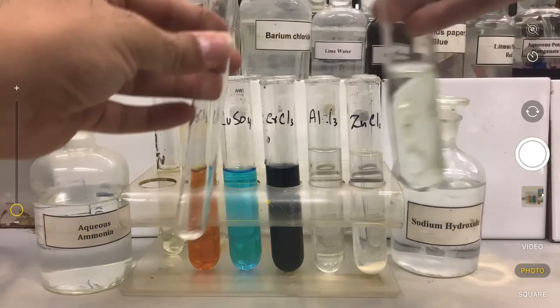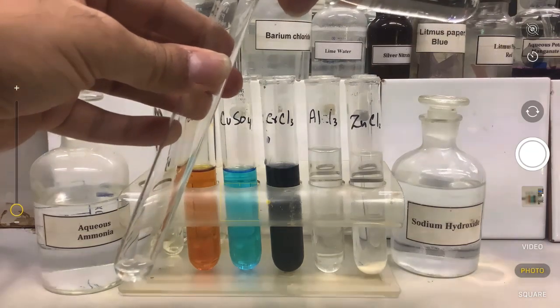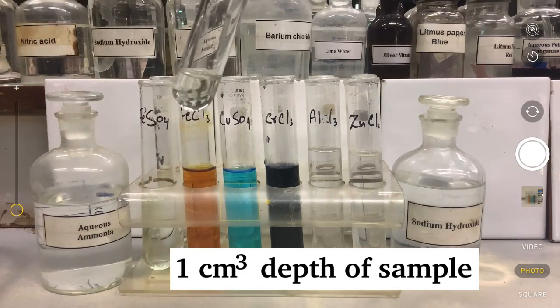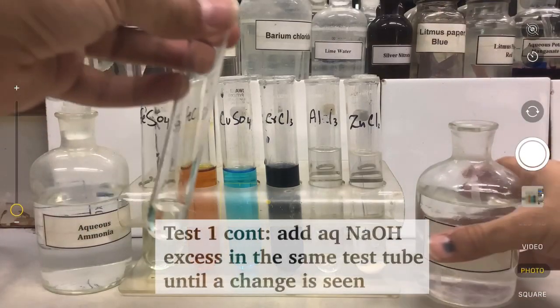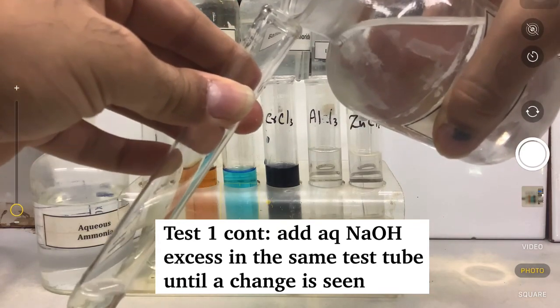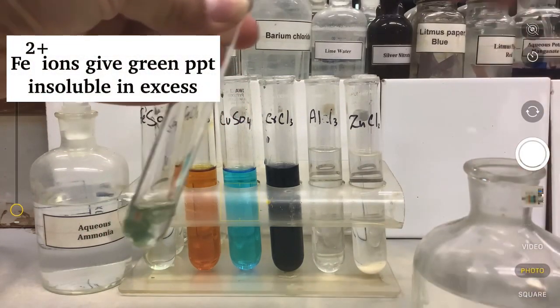Whenever we want to perform a test, we first take the sample in a clear test tube, which is dry obviously, and we carry almost 1 centimeter cube depth of the sample, which is a small amount, and we don't want to waste chemicals. The first test is mostly adding aqueous sodium hydroxide drop by drop until a change is seen. So you trickle the sodium hydroxide through the walls of the test tube.